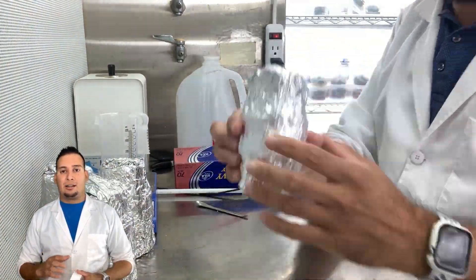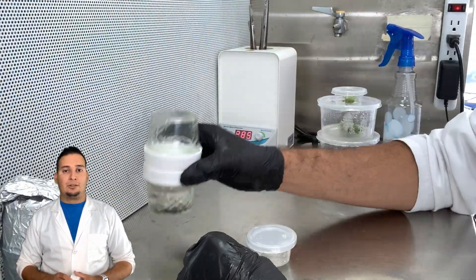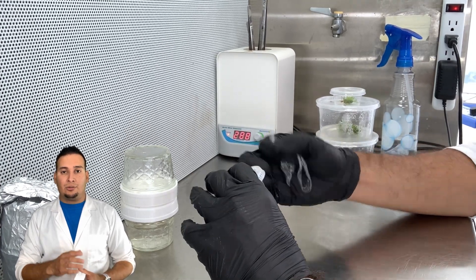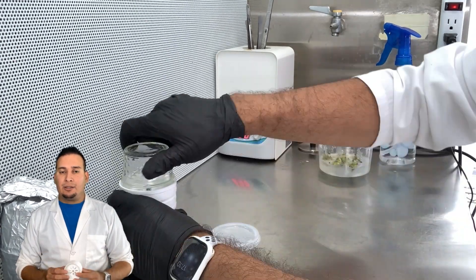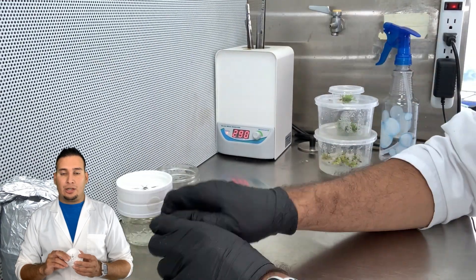After that I sterilized my bioreactors — the entire unit — using a pressure cooker at 121°C for 20 minutes. After the bioreactors cooled down, it was time to move the plants in.